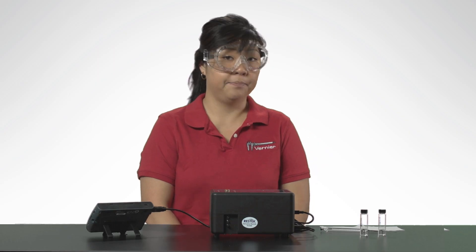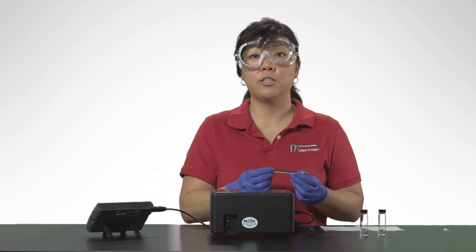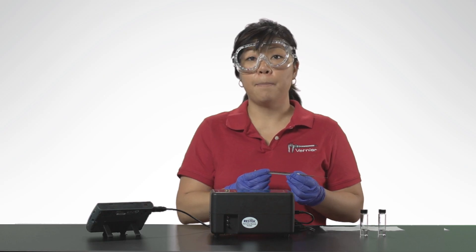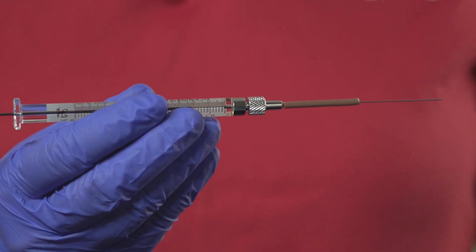While waiting, flush your syringe with the sample to be tested. The glass syringe is fragile. Be careful not to bend the needle or bend the plunger. Never pull the plunger back more than 50% of the total volume.